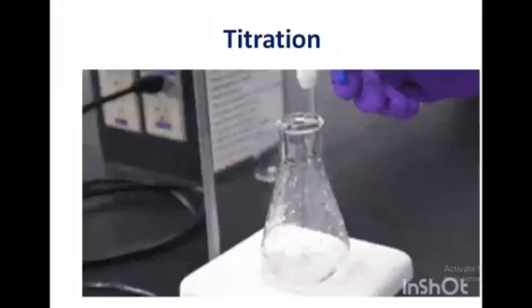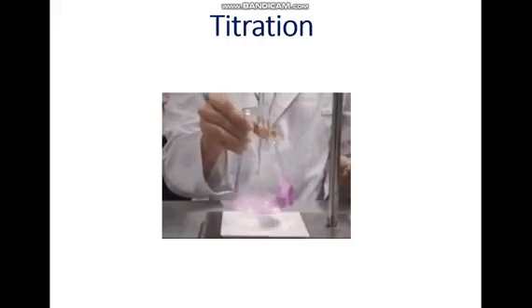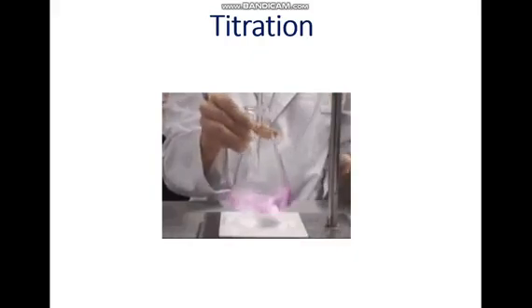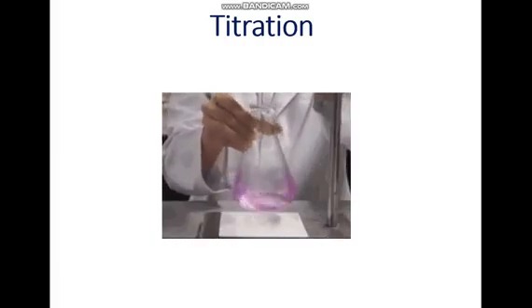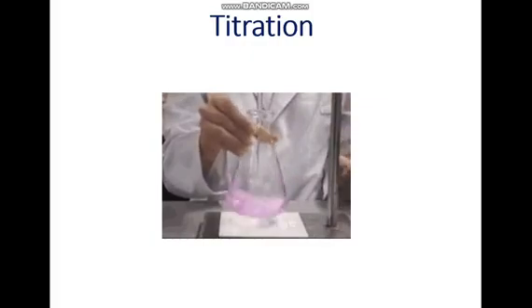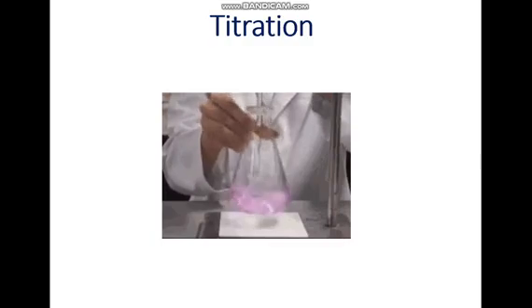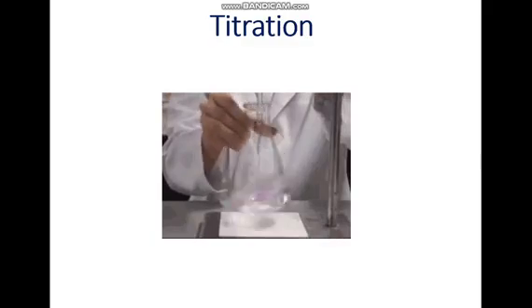What is titration? Titration is a laboratory technique that involves slow addition of one solution of a known concentration into a known volume of another solution of unknown concentration.